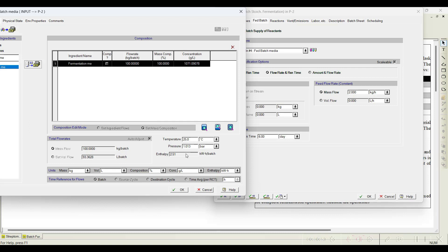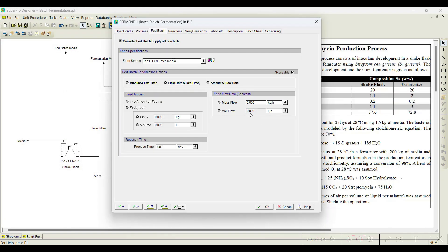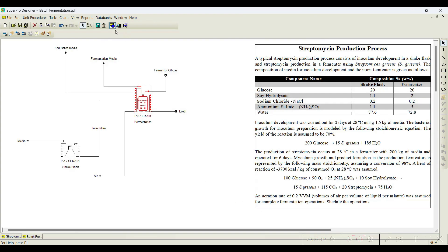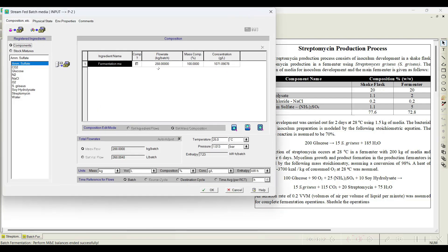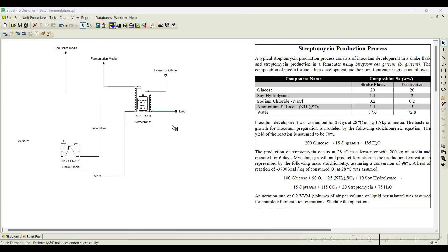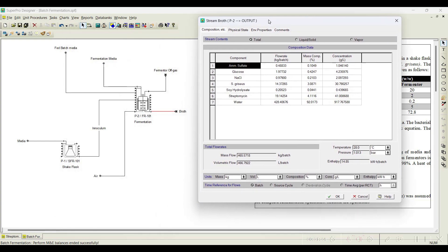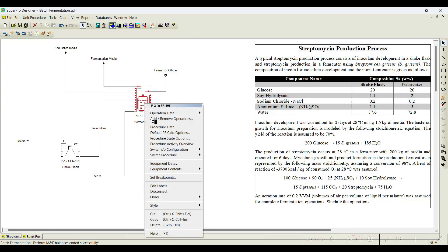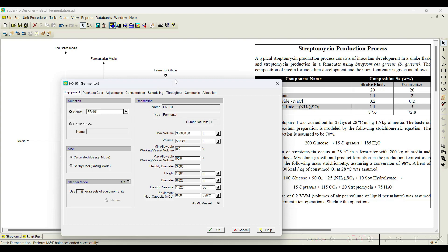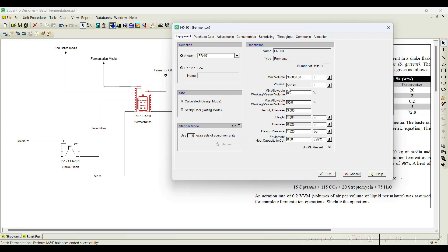Once we initiate this fed-batch at 2 kg per hour, we click OK and run the simulation. We can notice material and energy balance ended successfully. If you go back to the fed-batch stream, you can notice almost 288 kg of fed-batch media is consumed for six days. Also, if you recall from the previous video, we got almost 7.5 kg of streptomycin, but here it has increased because when media is increased, the streptomycin quantity also increases — it is around 19.14 kg. If you want to know how much reactor is required, by default design mode is selected and you require almost 583 liters of fermenter to carry out the operation.